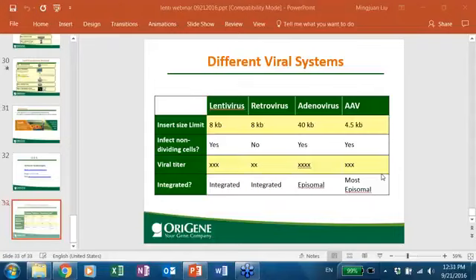If you want colonies, a cell line where the genome is pure, if you want individual cell colonies, of course you can isolate single colonies. You can just seed at very low confluence and let them grow into single colonies and pick the single colonies, and that's individual cell colonies. Or you can use it as a stable pool. There are two ways to do it.